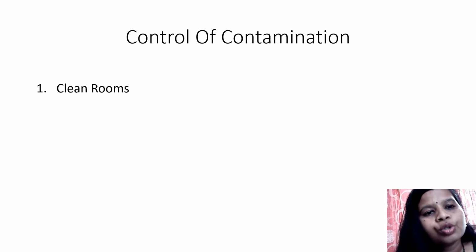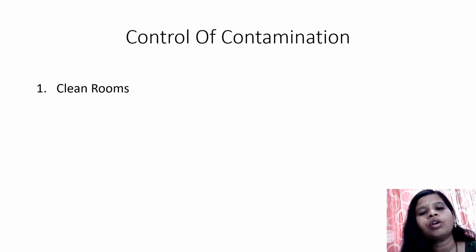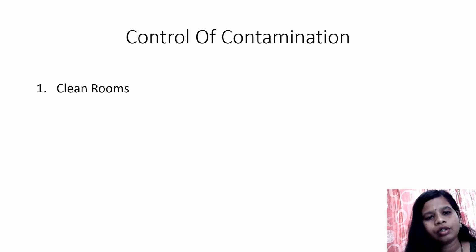The floors, walls or windows should not have accumulation of dust or dirt, because this accumulation can lead to contamination.